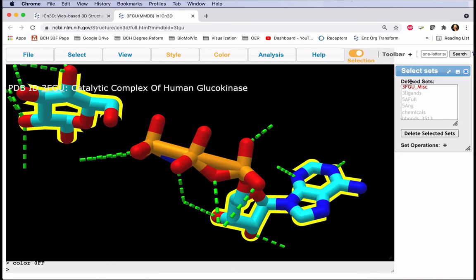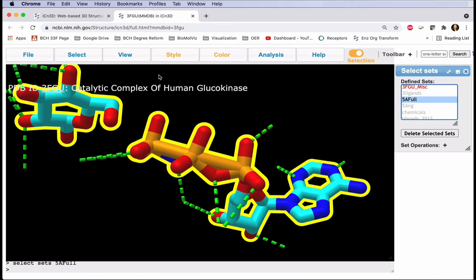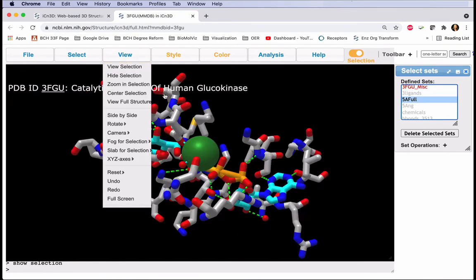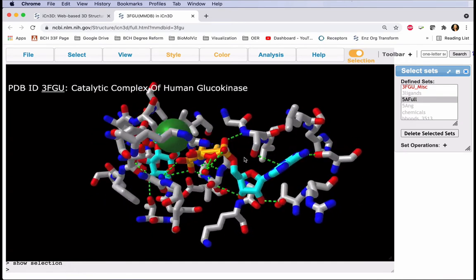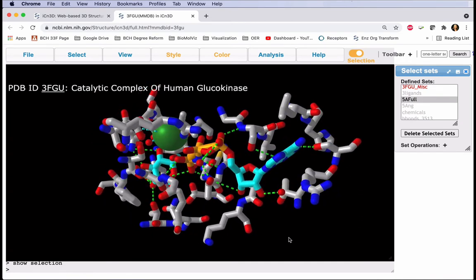To go back to our 5-Angstrom active site, click 5A Full in the Select Sets menu, and view the selection. Now we can clearly see our ligands among our protein residues.